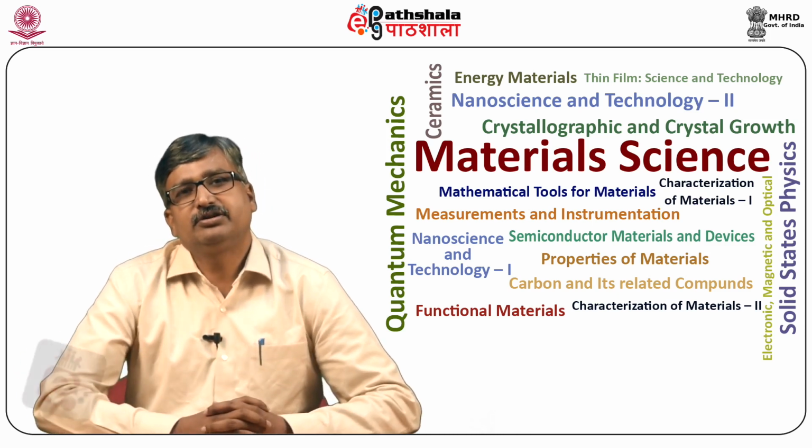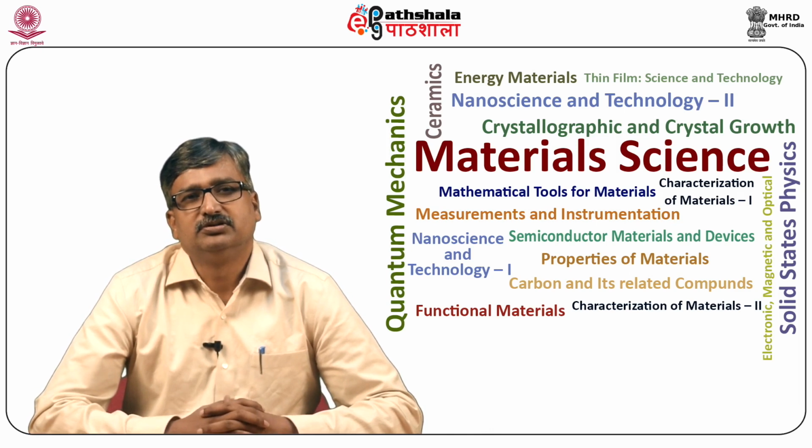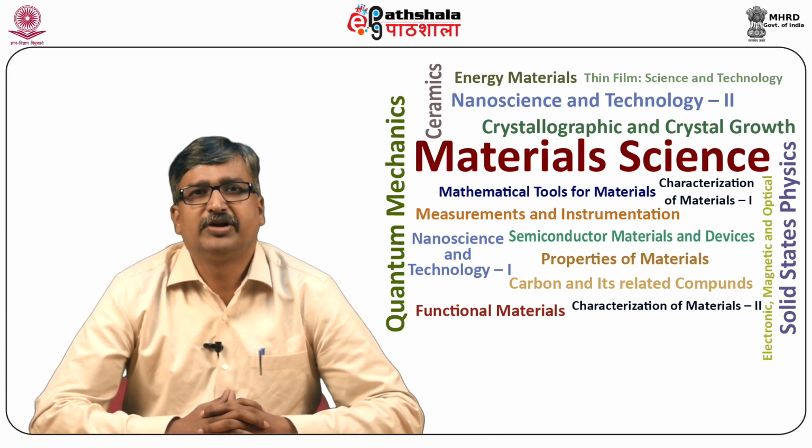Today we are going to discuss the module titled Ultraviolet Visible Absorption Spectroscopy, which is also known as UV-Vis spectroscopy, under the paper Nanoscience and Technology 2.